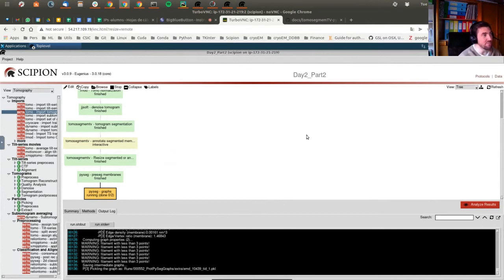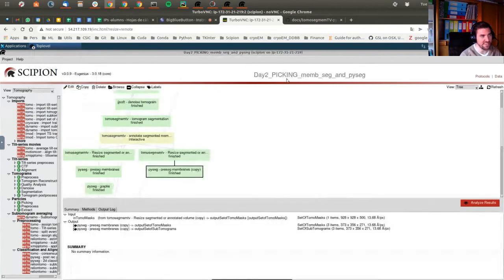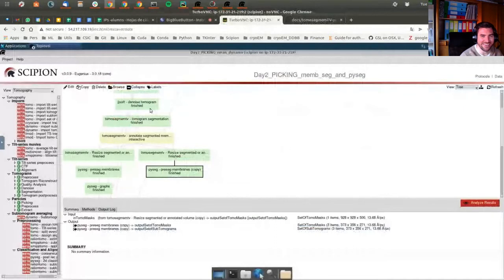Okay, so to finish it and continue the description of the parameters, I suggest, as José Luis Vilas has said, that we can open this project from the project list, the ones yours is done. Have you hacked my machine, Dimitri? No, I'm serious. I did it. I clicked it just before. I refreshed it and it's done. So I guess you're also close to the end.